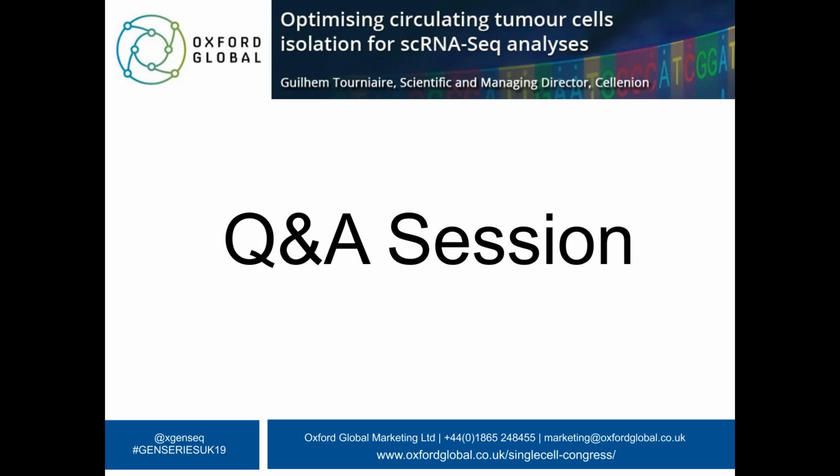Okay, and our final question today. Why can't people use the Chromium from 10x Genomics directly on the enriched sample? Well, they could, but this will be very expensive for them. Actually, there is a paper published, I think, in Scientific Reports in 2018, where they did just that.